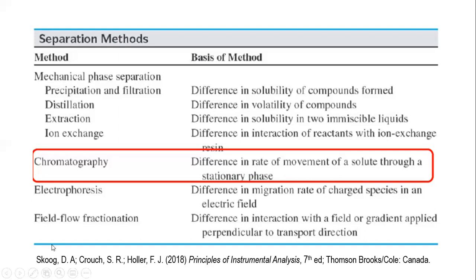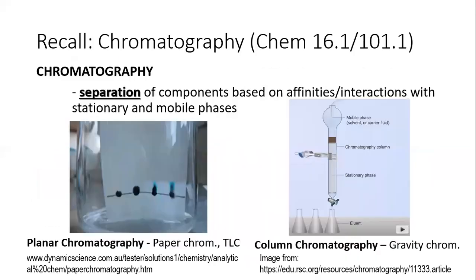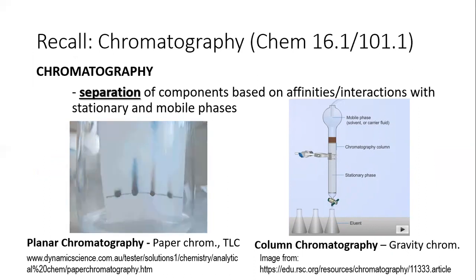So chromatography is another way of separating your compounds. This time, chromatography separates your compounds depending on their interaction with the stationary phase. You've already encountered chromatography back in Chem 16.1 as well as in Chem 101.1.